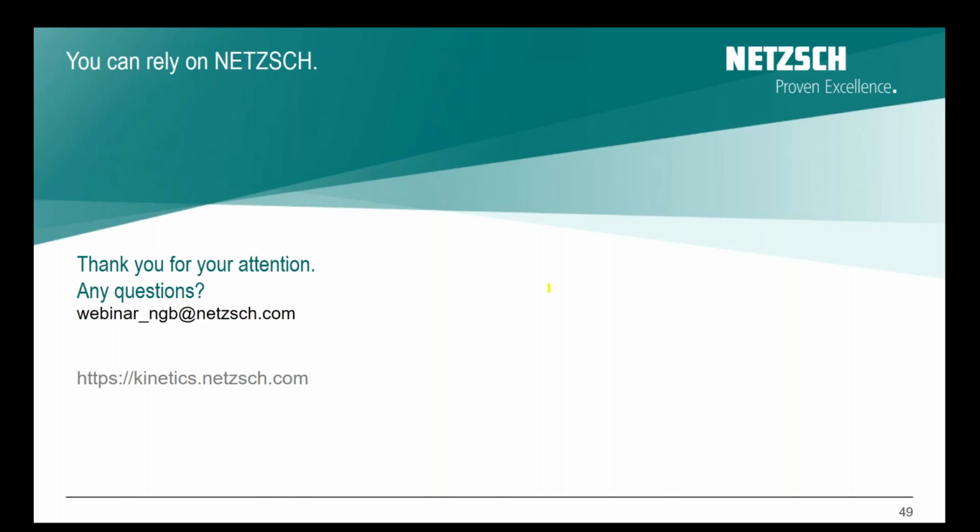And one person asked us, have you done any modeling and predictions on formaldehyde-based thermoset resin cure? And if so, can we share the data? What kind of thermosets? A resin cure. Yes, we did. Okay. So maybe we can send it out to this particular person. Yes, we have some application notes, and I think we can send it.